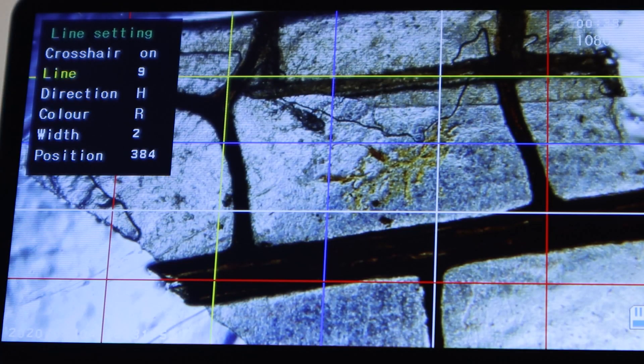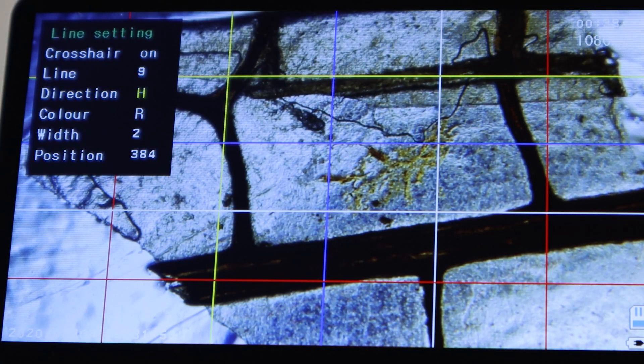Select whether it should be vertical or horizontal, choose a color, line width, and position on the screen. This can help you orient and define specific areas of interest on the sample that you're viewing.